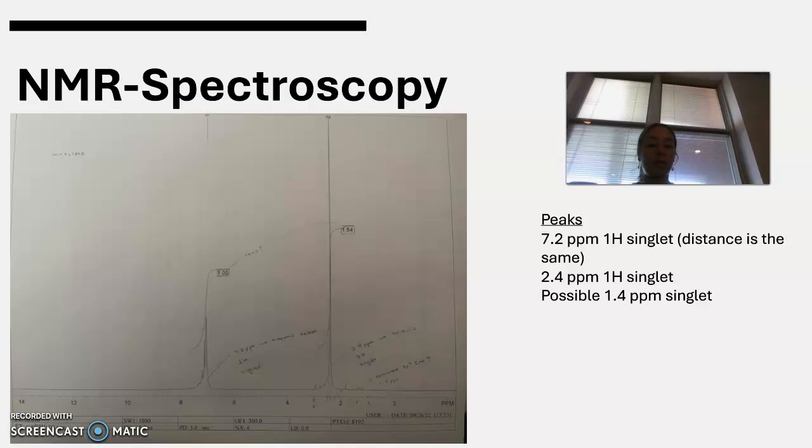Then we went to the computer and ran a whole bunch of programs so that we could find the middle of the peaks, label the peaks, and find out their ppm values. And we ended up with this NMR spectroscopy for my unknown sample.